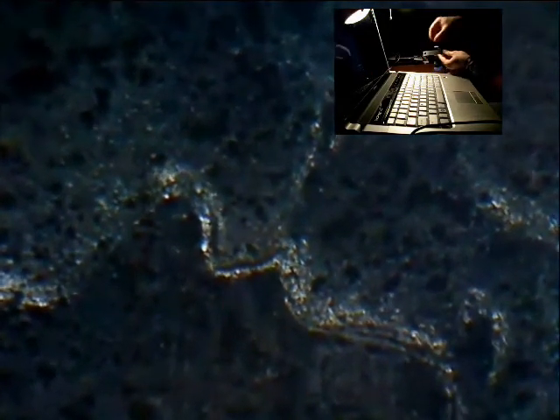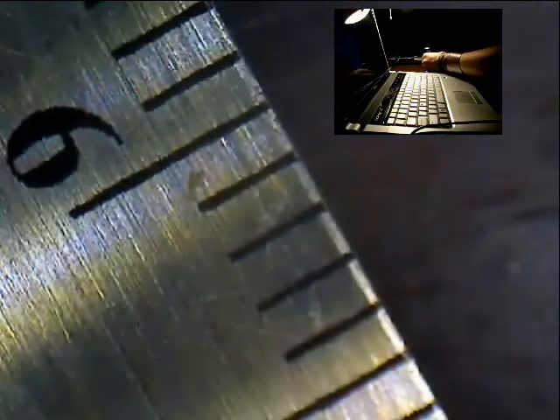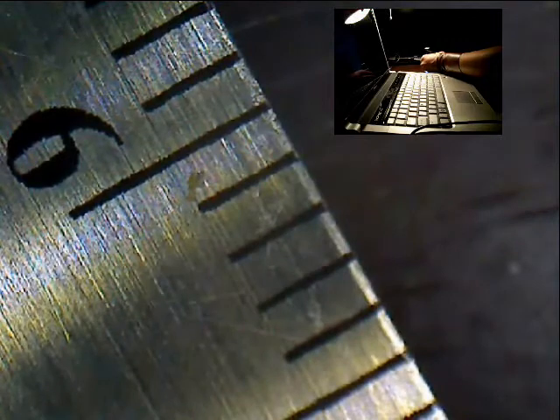Next thing that I have is a ruler. We're going to look over here, which is the big ones are centimeters and the small ones are millimeters. Zooming down to low. Here's low setting, pretty well in focus. And then I'm going to zoom in. I may need to turn up the light on this some. You can rock back and forth through focus, but that should be pretty good focus there. I'm going to move around, and there is six, six centimeters.